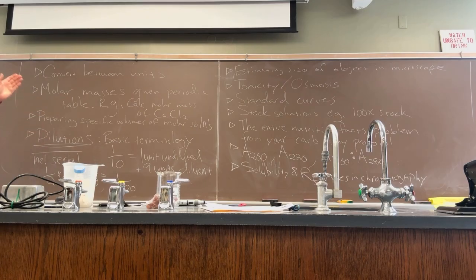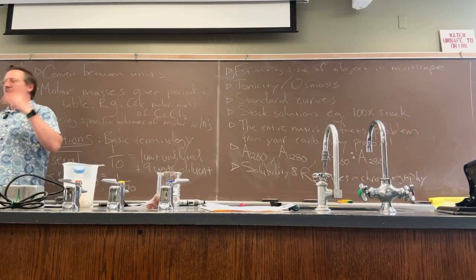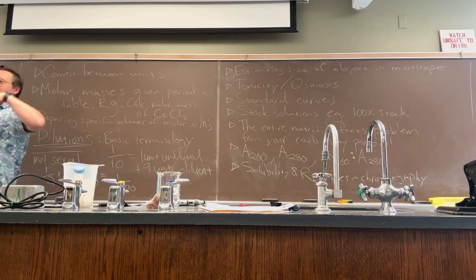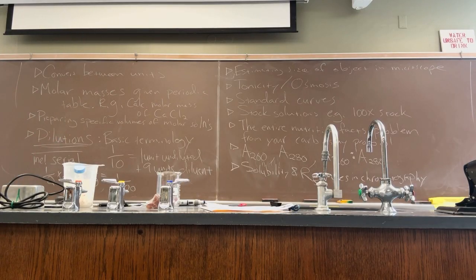The question is on what we did in the lab, where you had to write it all out and do it for the lab to work. Taking the nutrition facts, calculating what the final concentration will be. Not from the online assignment, from your protocol. At the end of the protocol, there's a picture of a nutrition fact sheet, and it asks what's the concentration in micrograms per milliliter, and then how much would I have to dilute it. That's what I'm referencing.